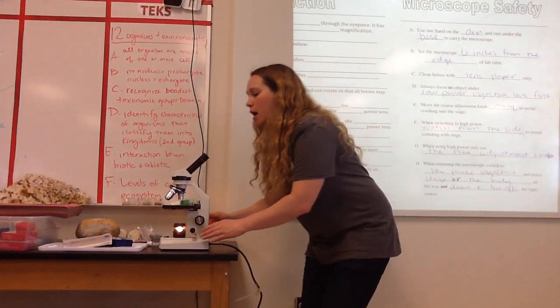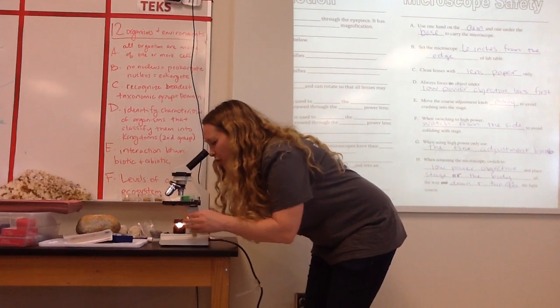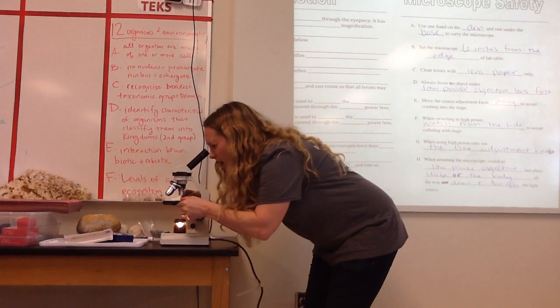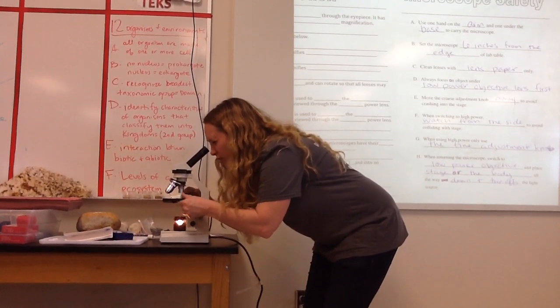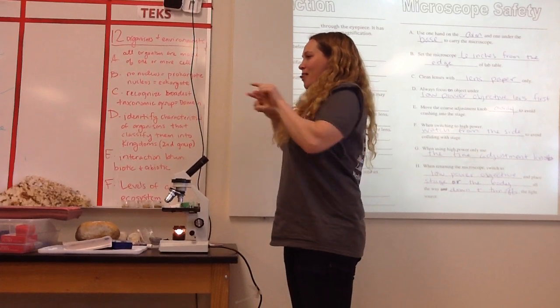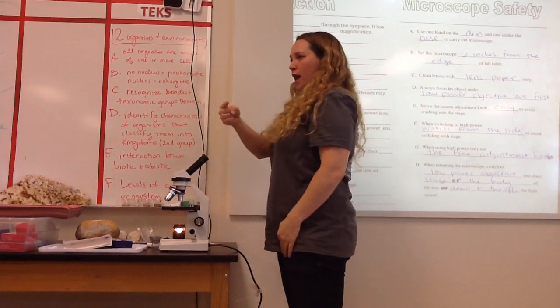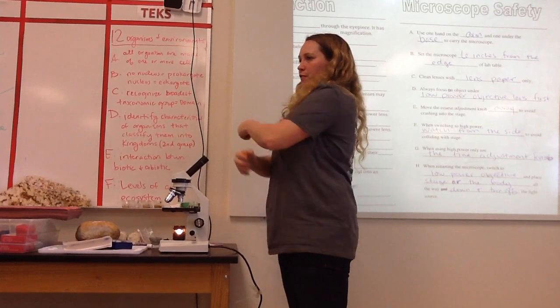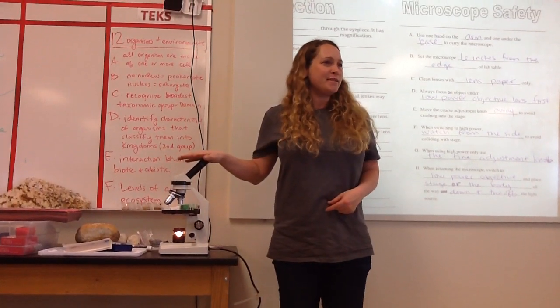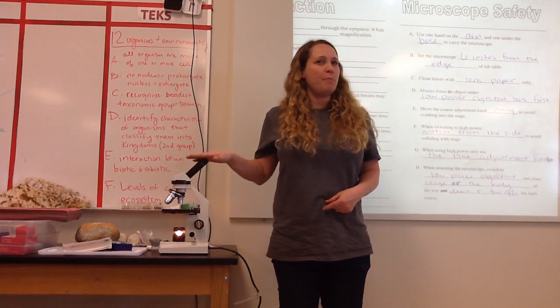Okay? So I put my eye on. Now I can see a little blue object. It's not right in the middle, so I'm going to move the slide a little bit till it gets right in the middle. It's really weird on the microscope. When you want things to go this way, you have to push them that way. When you want things to go right, you have to push them left. If you want things to go left, you have to push them right. Who knows why that happens? It has to do with some kind of optical thing.